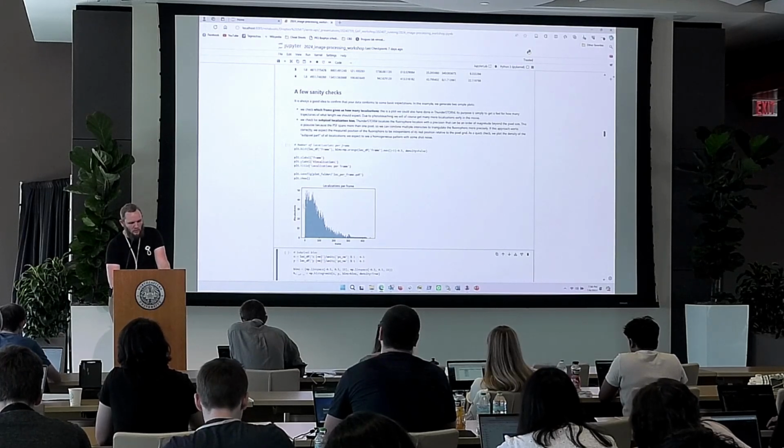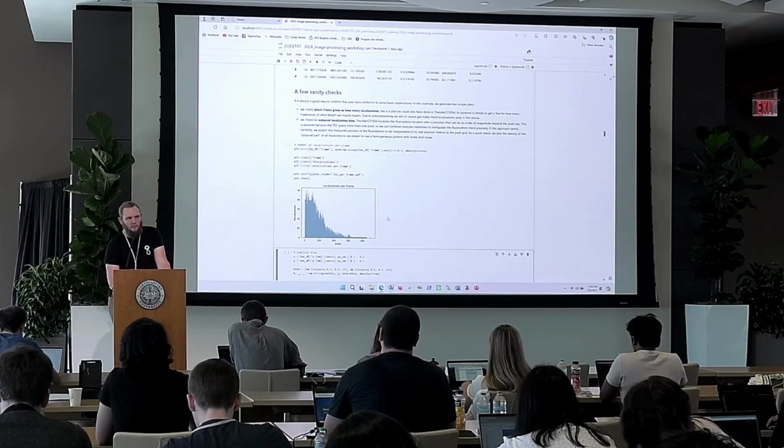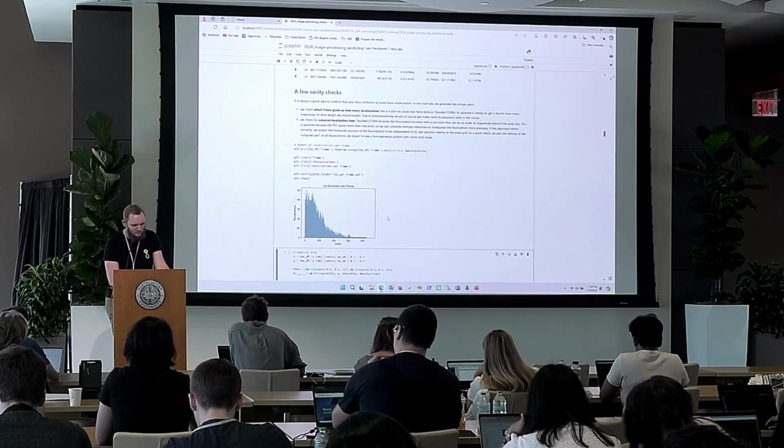You can see that the number of localizations decreases sharply as the movie progresses. There is this one spot here that just shows up until frame 400 something. And this matches with what we saw visually in the movie, so that's good. That means that our localizations are probably reasonable.